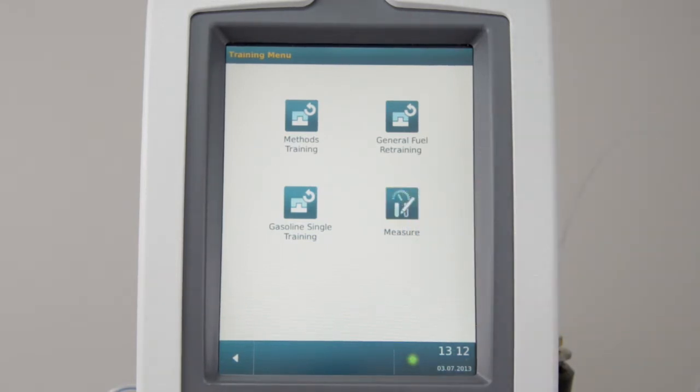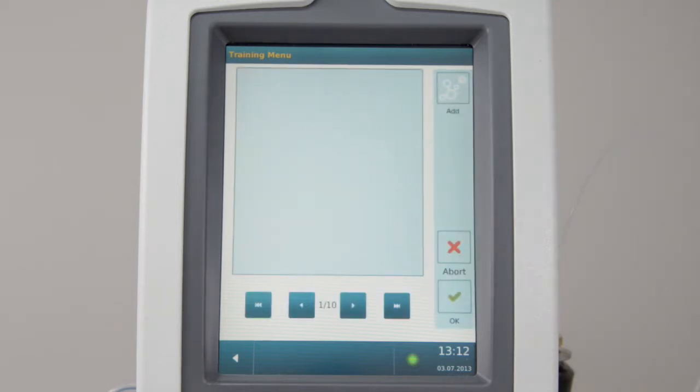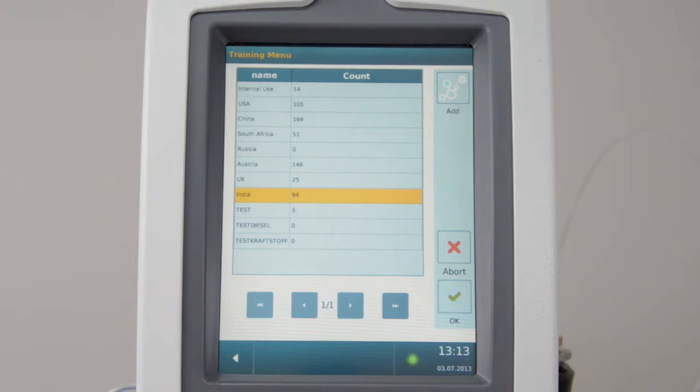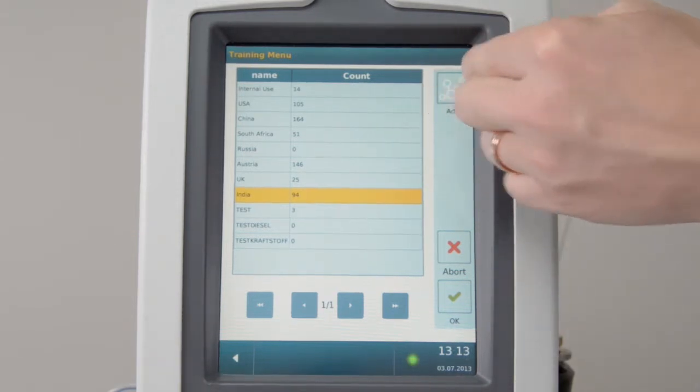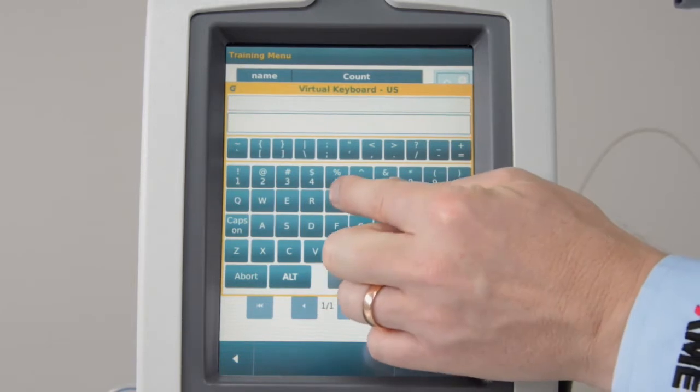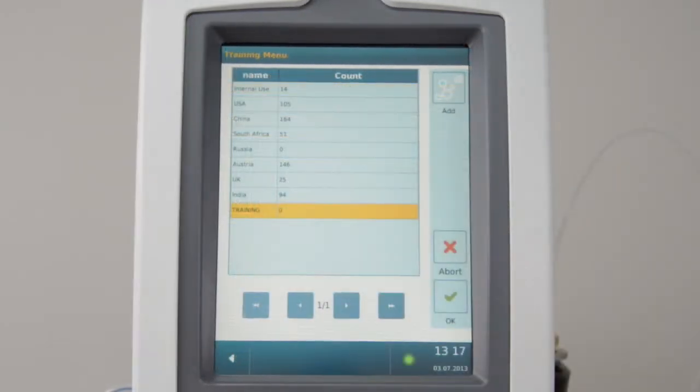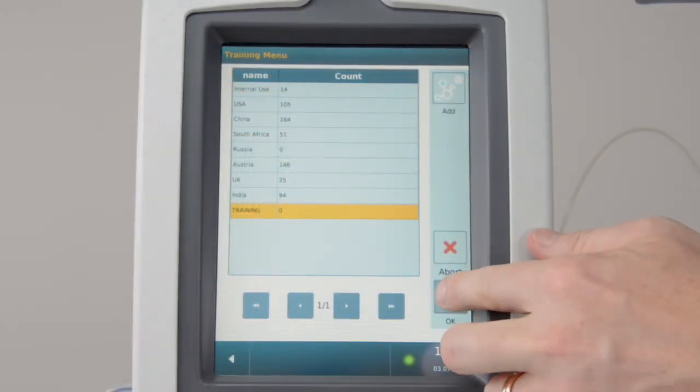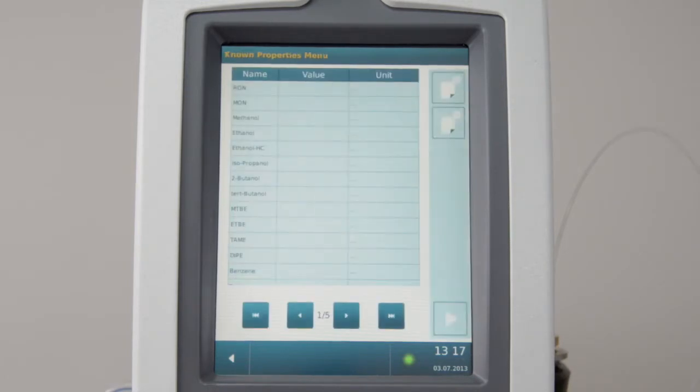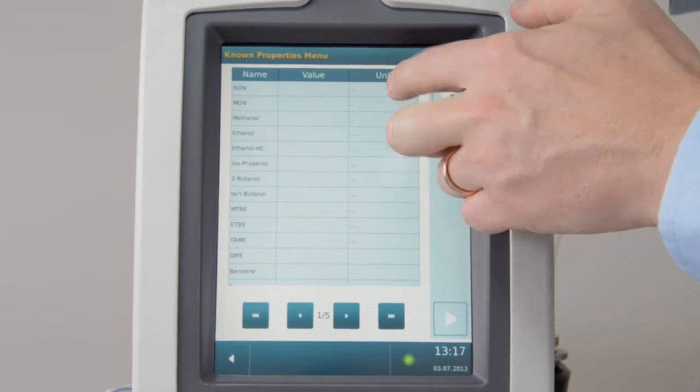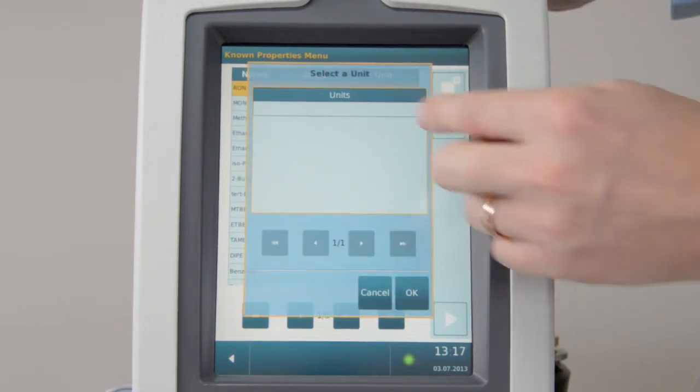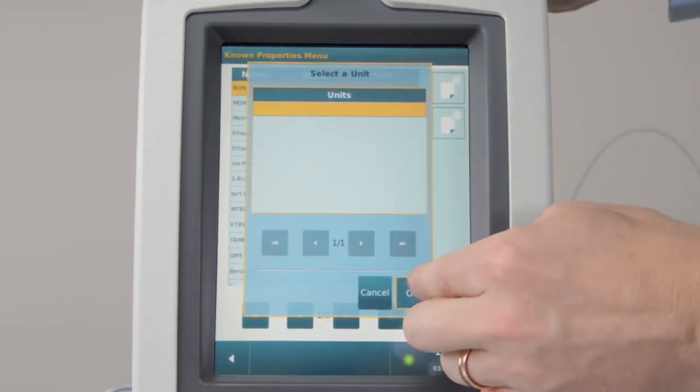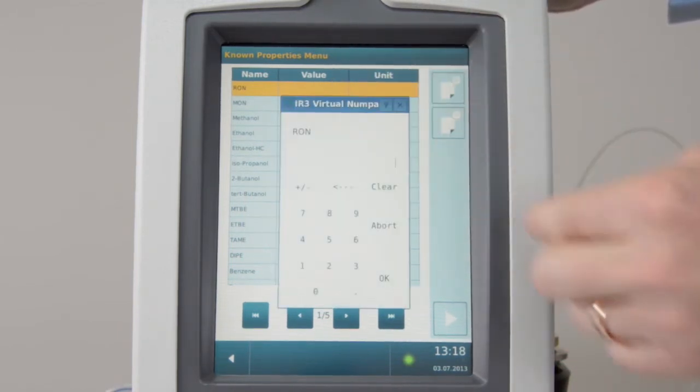In this training exercise, we will not add a sample to an existing group. Instead, we will create a new group. Press Add and enter the name of the group. Select the new group and press OK. Then, add the known properties for this sample. Always select a unit field for any property. Now the new sample is characterized and assigned to a calibration group.